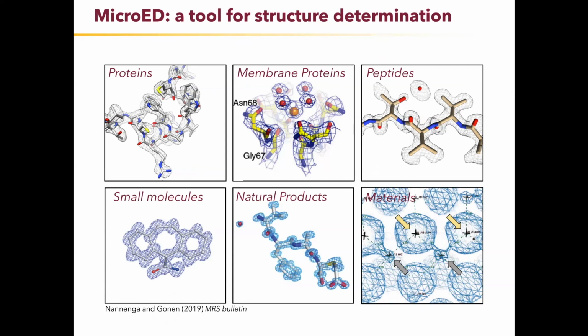So it's an exciting application for MicroED. Peptides have been very successful for MicroED, solving the structure of different peptides that only grow small crystals. Recently, a lot of excitement has come out from the organic chemistry community about using MicroED for small molecules. And honestly, this is a lot of what I am doing currently, using small molecules and helping people solve structures of small molecules. I'll highlight an example of that.